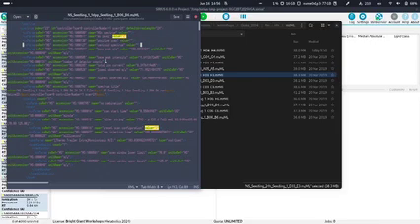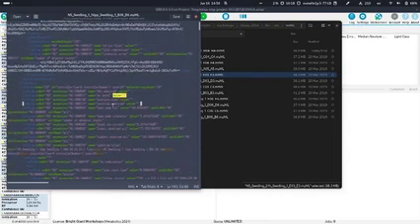Now we also import compounds which have no MSMS, because many people also want to do quantification or statistics on the MS1 intensities. So all this stuff is now in there. But of course, SIRIUS is still mostly about MS annotation, so it doesn't make much sense to use SIRIUS if you have just mzML files without MSMS.